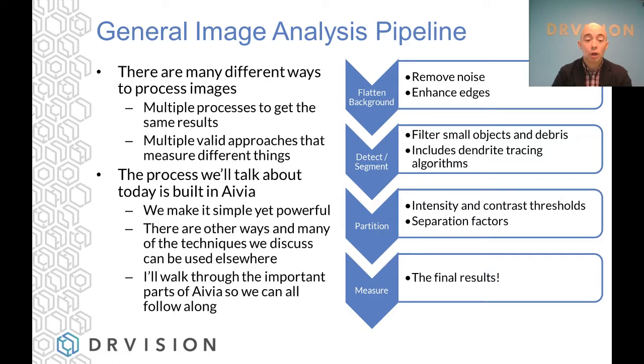Today, we're going to talk about a process that is built into Aivia. We make it simple yet powerful. There are other ways, and many of the techniques that we discuss in this presentation can be used elsewhere. But I am going to walk through the important parts of Aivia just so that we can all be on the same page.